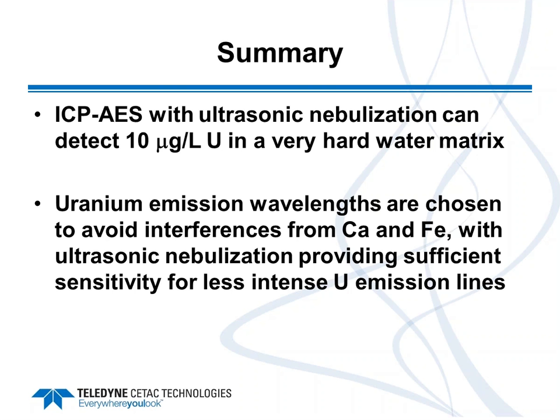What is the factor upon comparing the standard nebulizer with ultrasonic? The factor is simply that we compared actually two factors, raw sensitivity, and then we also compared the limits of quantitation after factoring in any noise from the background. For ICP-AES. Again, it would be if you compared the standard nebulizer with the ultrasonic. So if you had a very clean matrix and an area of the ICP mass spectrum which is very clean, particularly at high mass, in general you might be able to see a factor of up to tenfold improvement, again depending upon how low the blanks are. And that's going out into the area where you would have rare earth elements, platinum group elements, and actinides.